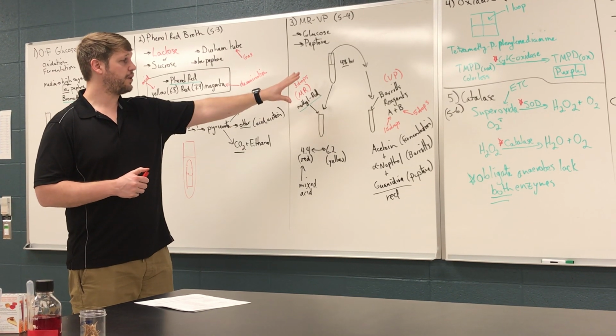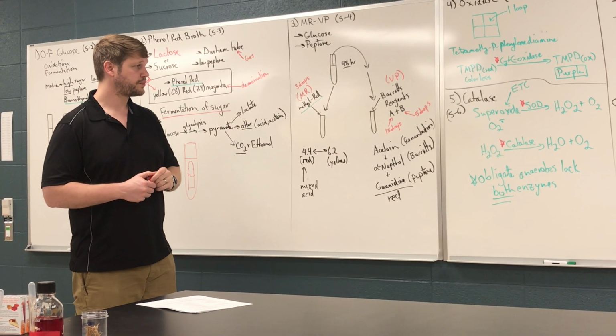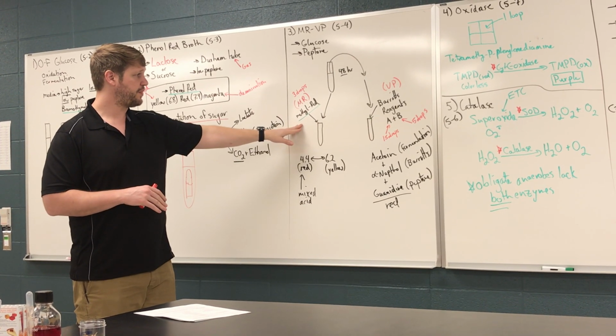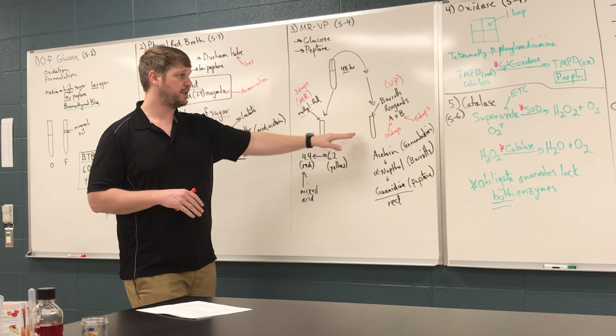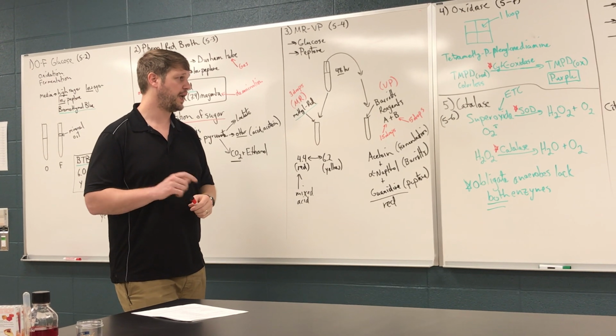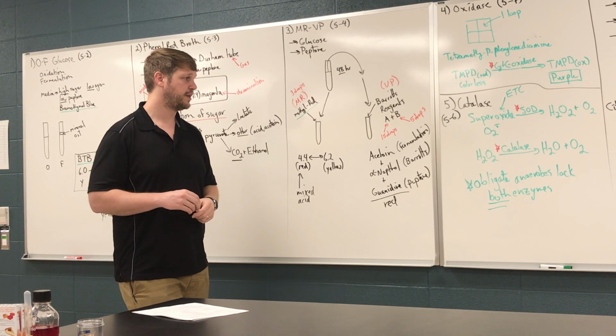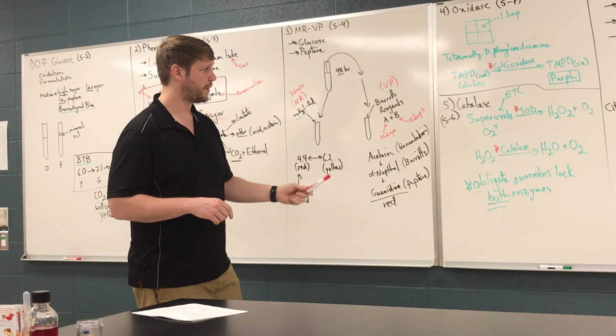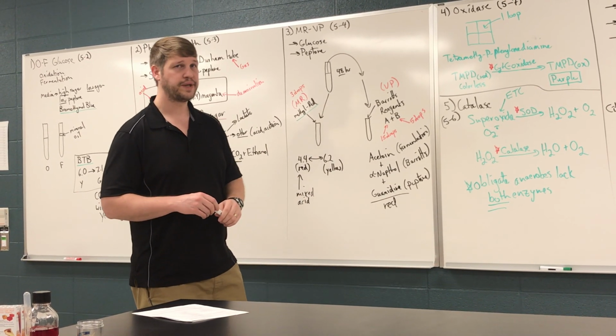So 48 hours, split it, the methyl red into one of the 2 tubes, and then the Barritt's reagents, A and B, added sequentially to the second. Any questions about that?